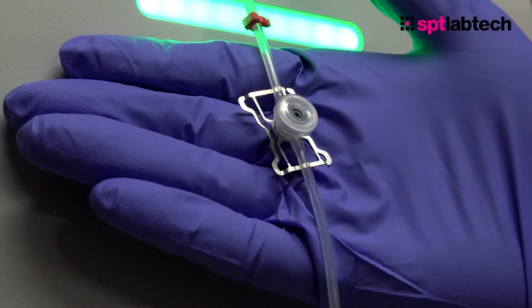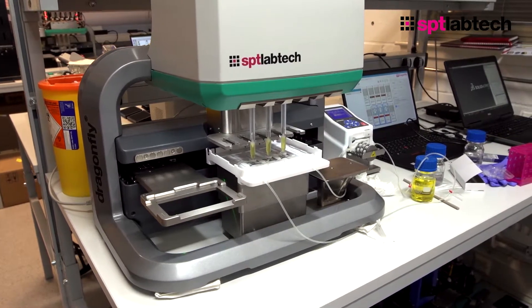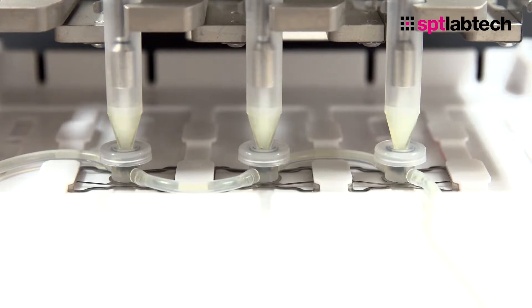This is the Auto Feed Reservoir, or AFR for short, and what that allows users to do is take the reservoir feed offline from the instrument and have it automatically pumped to a small set of ports beneath the tips for aspiration and dispensing, without any human need to refill or replenish the manual reservoirs.